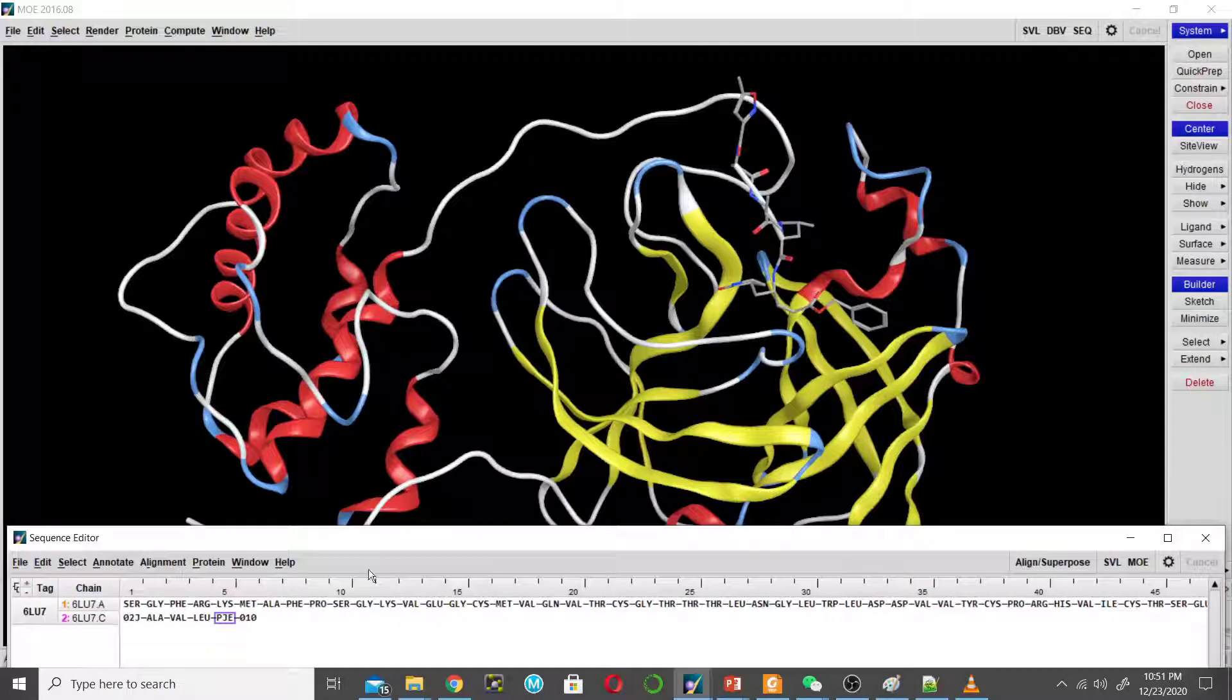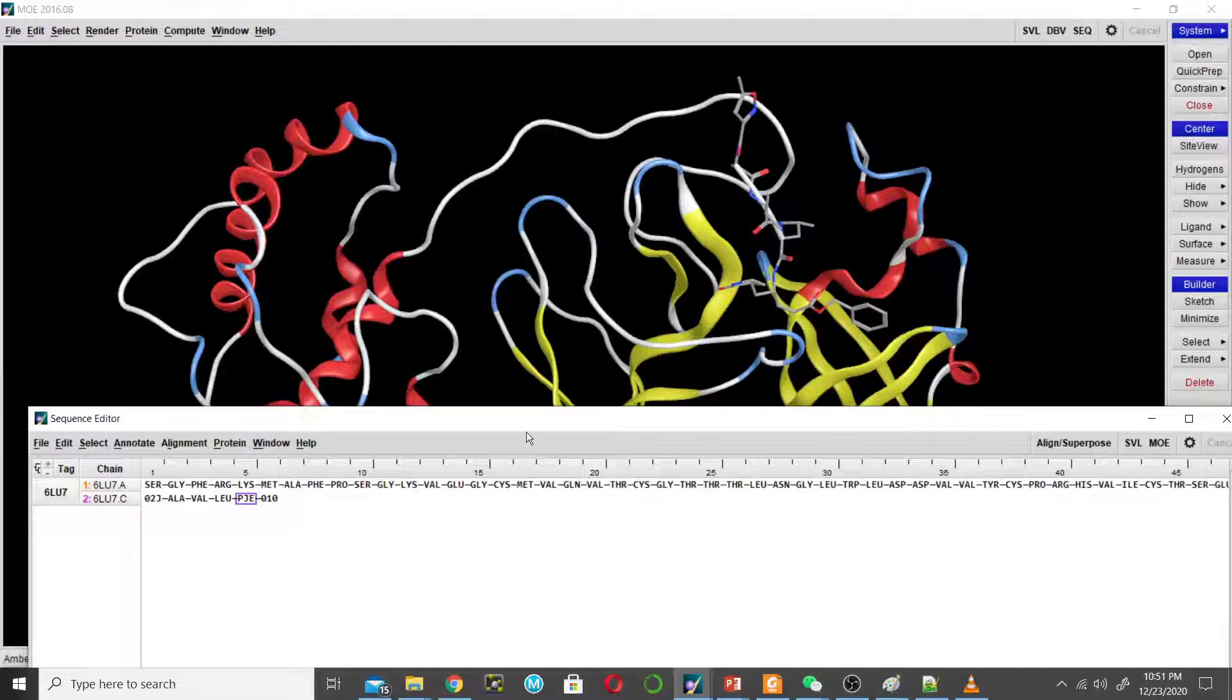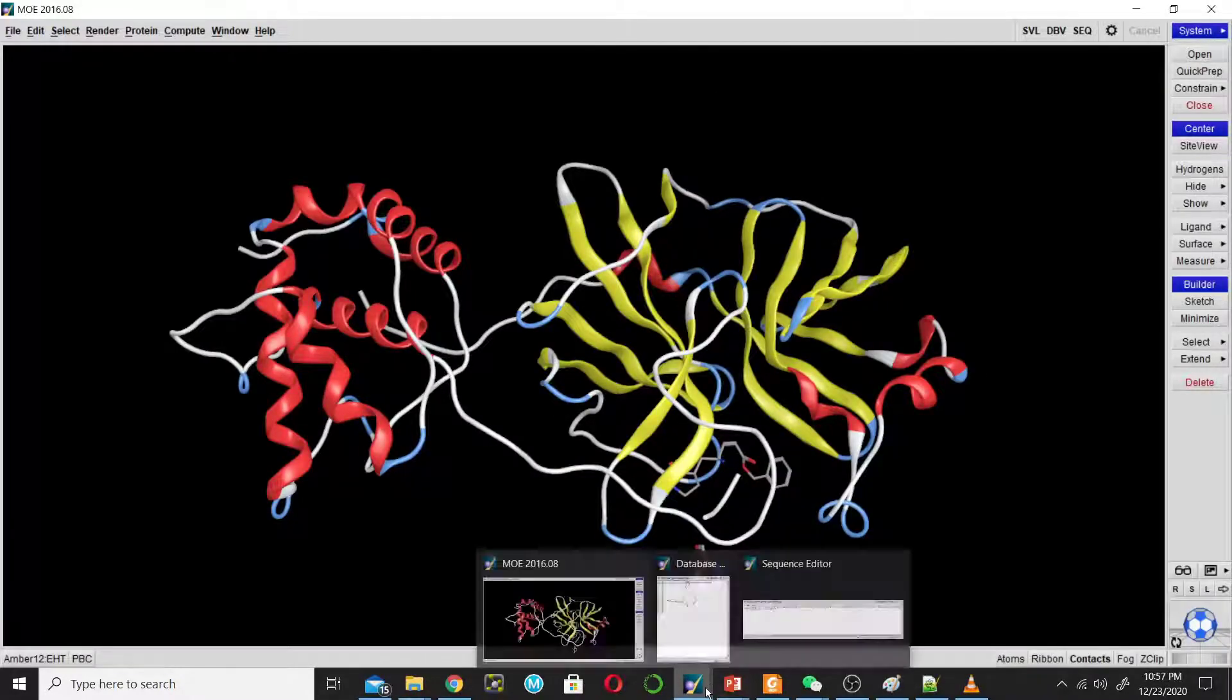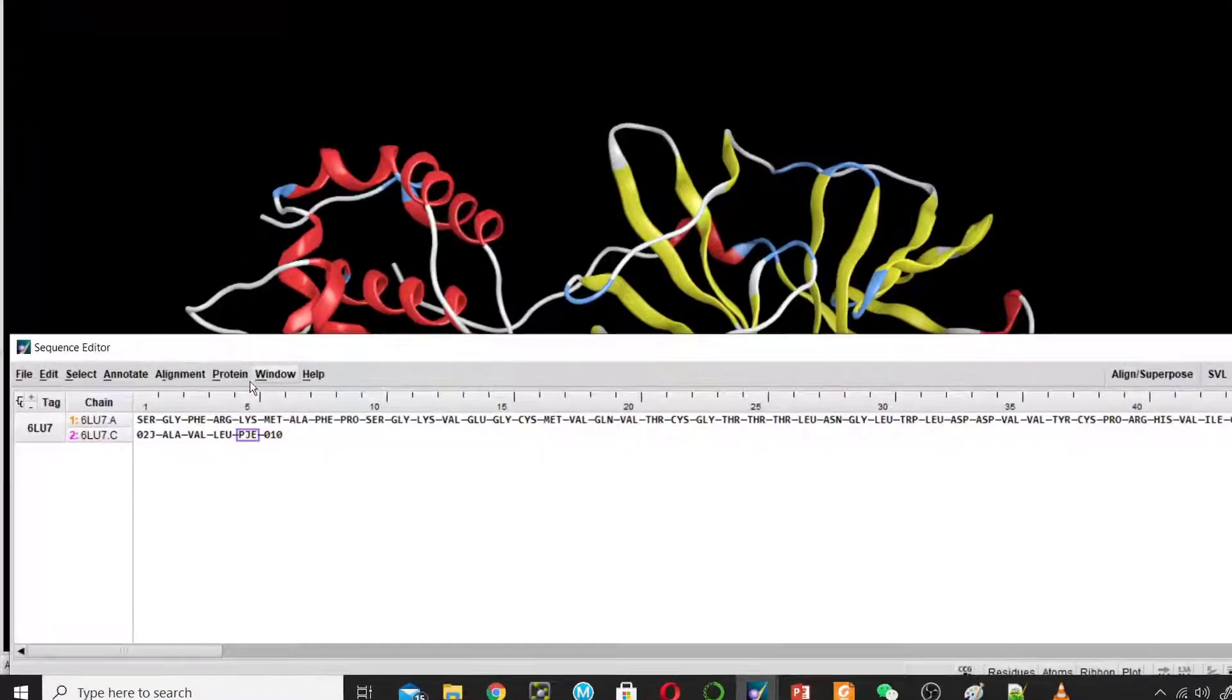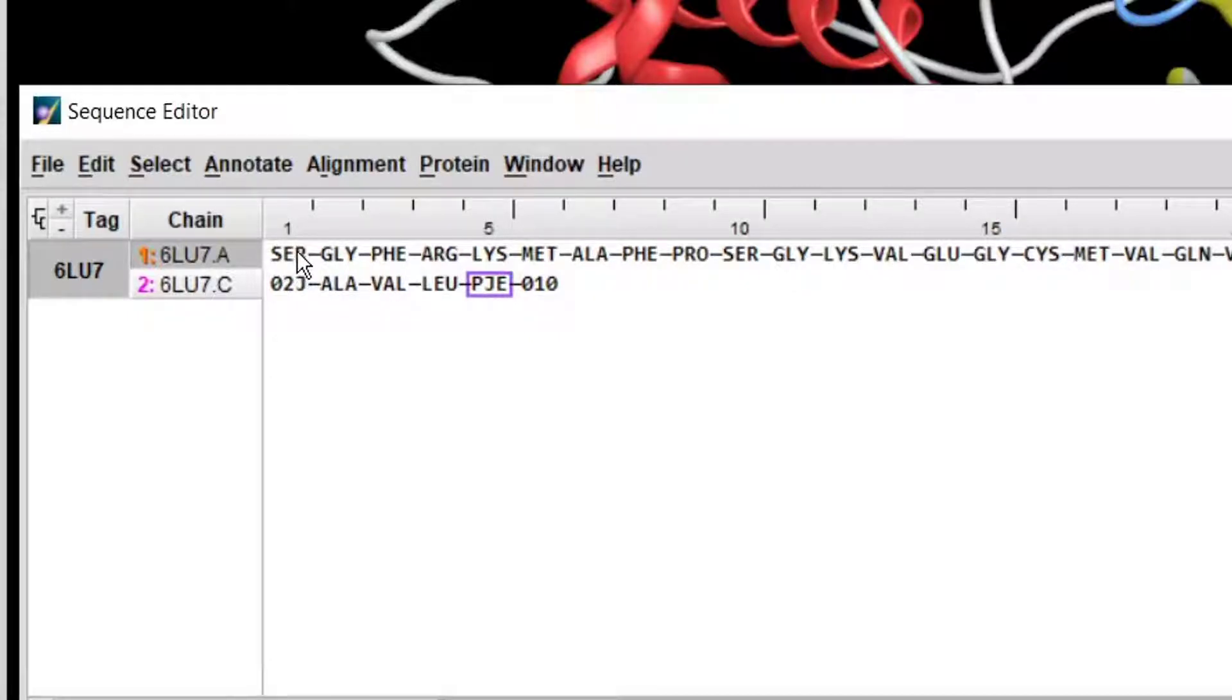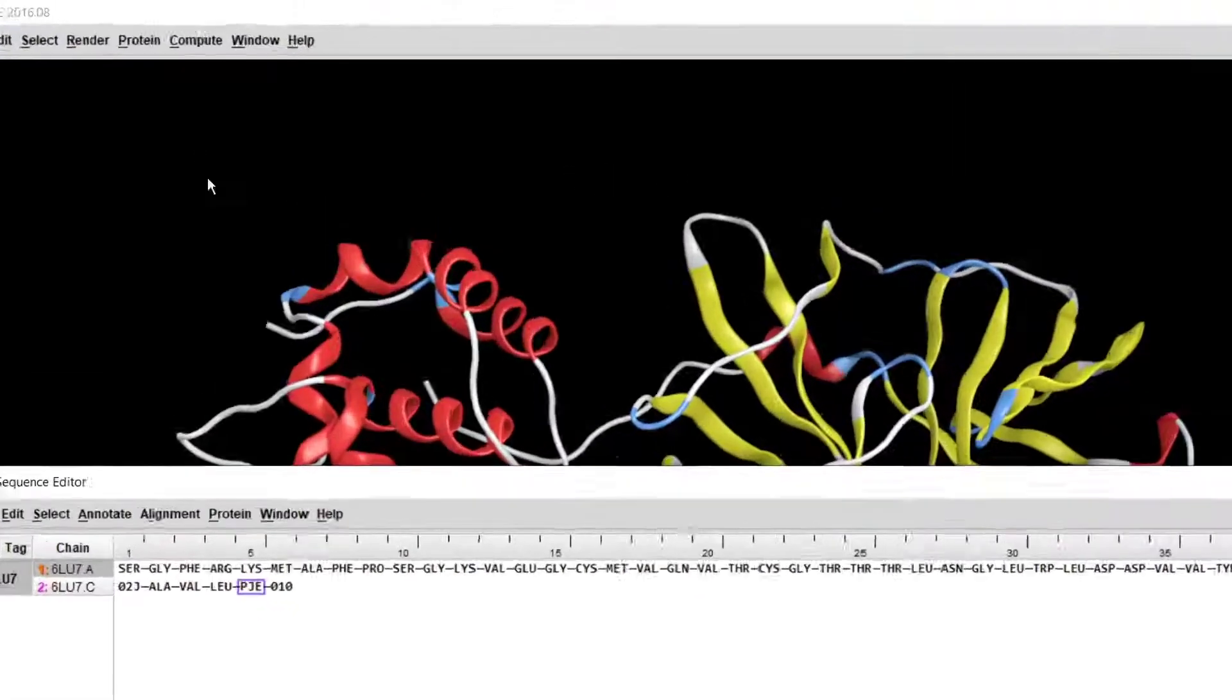Now we will prepare the structure to add missing atoms. So go to sequence and click the first chain. This is the protein, and we want to add missing atoms only to this chain, not to the peptide inhibitor. So select chain A.